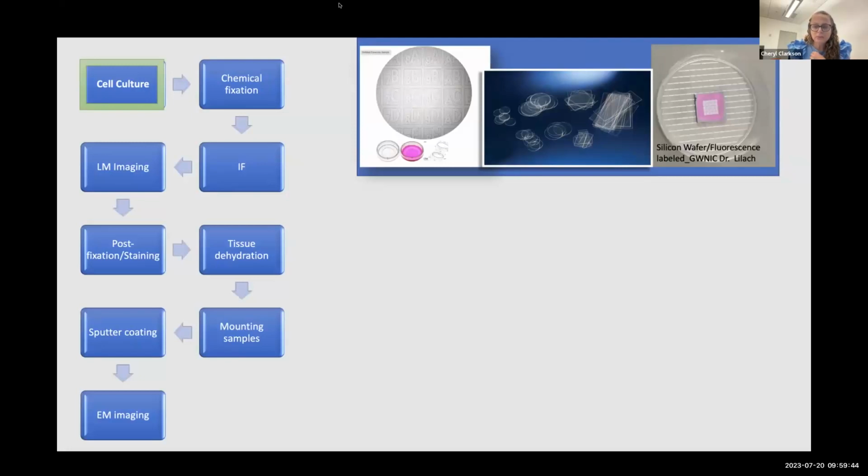The silicon wafers come from the nanofabrication part of our center. So one of our scientists has printed some fiducial points on our silicon wafers. He can even put some fluorescence in there, so we can see like A and B, whatever, in fluorescence. So if you are fancy enough, you can get fancier. But if not, you can also just scratch your silicon wafer or your glass, and you can run it. So it's just whatever makes your life easier.